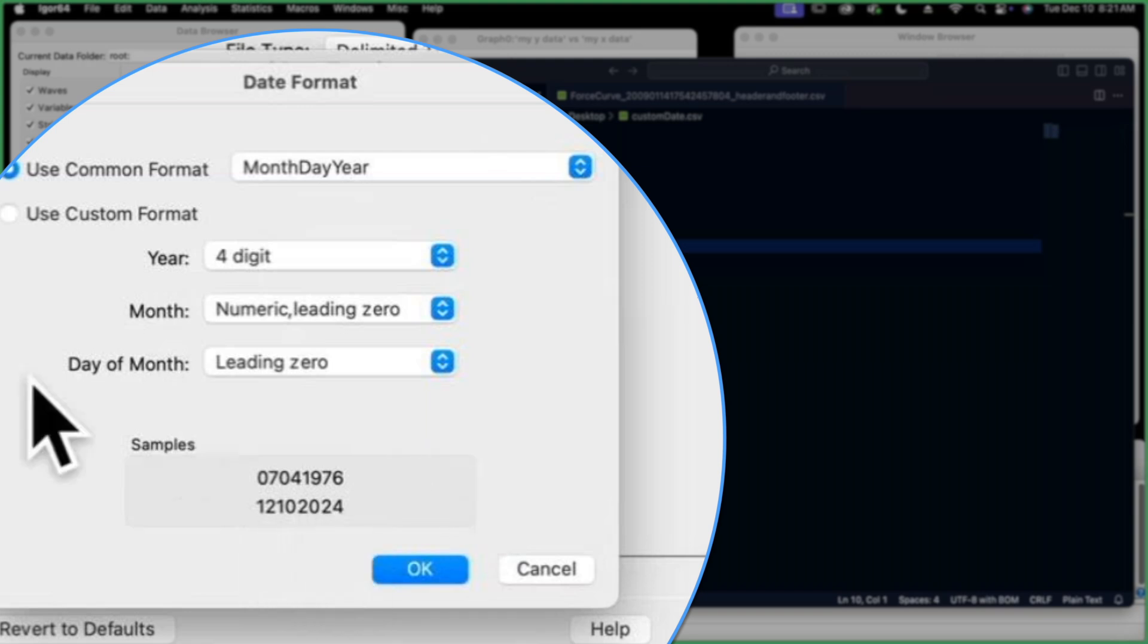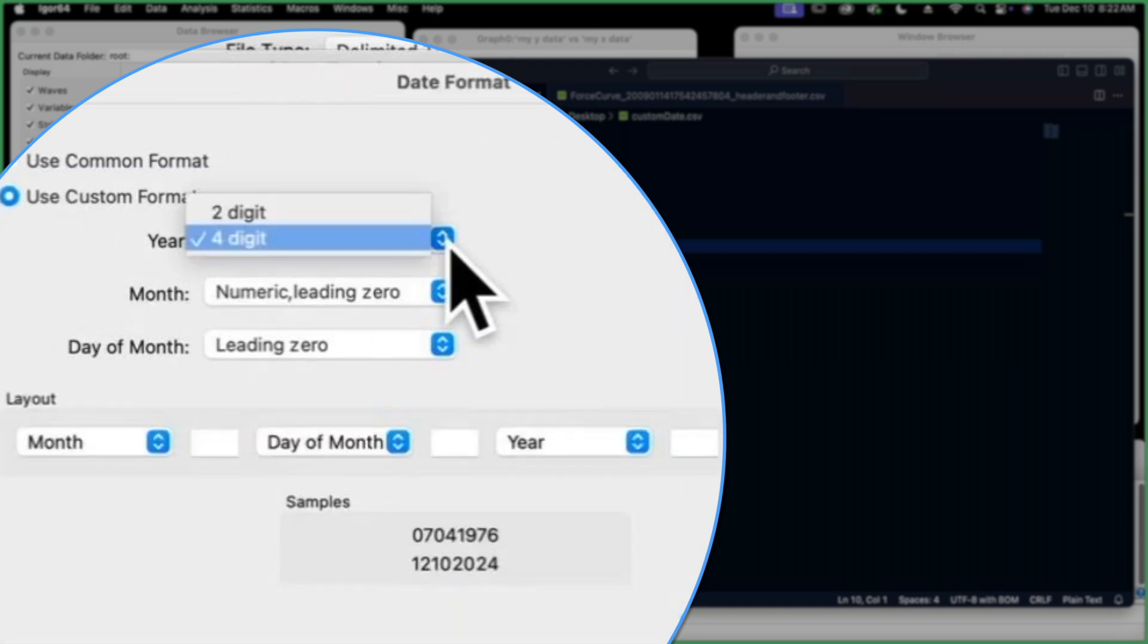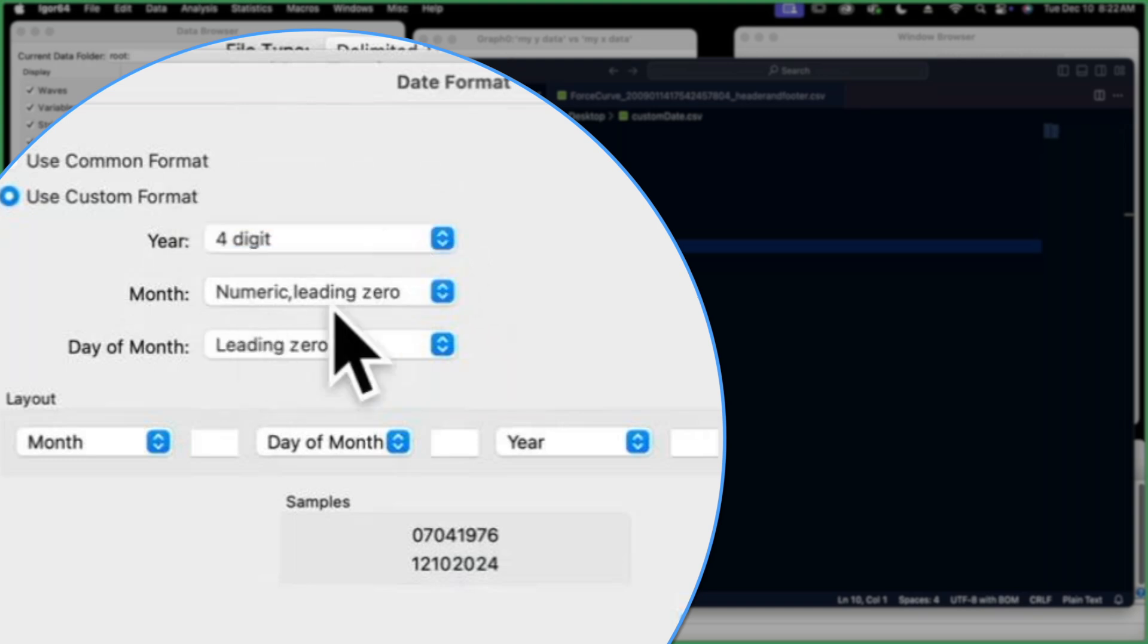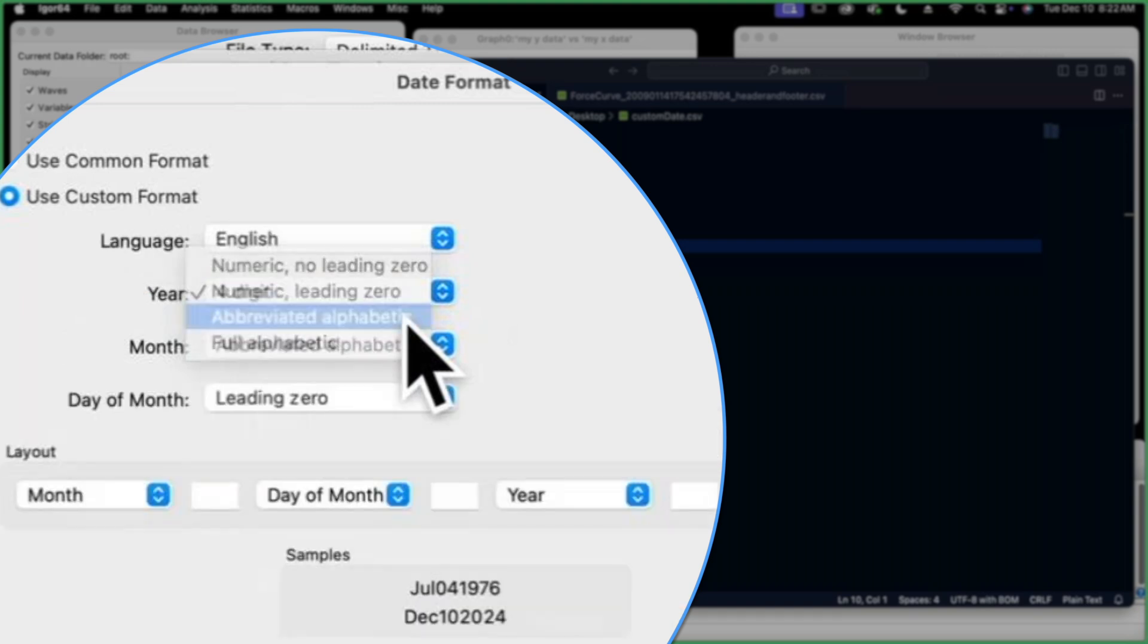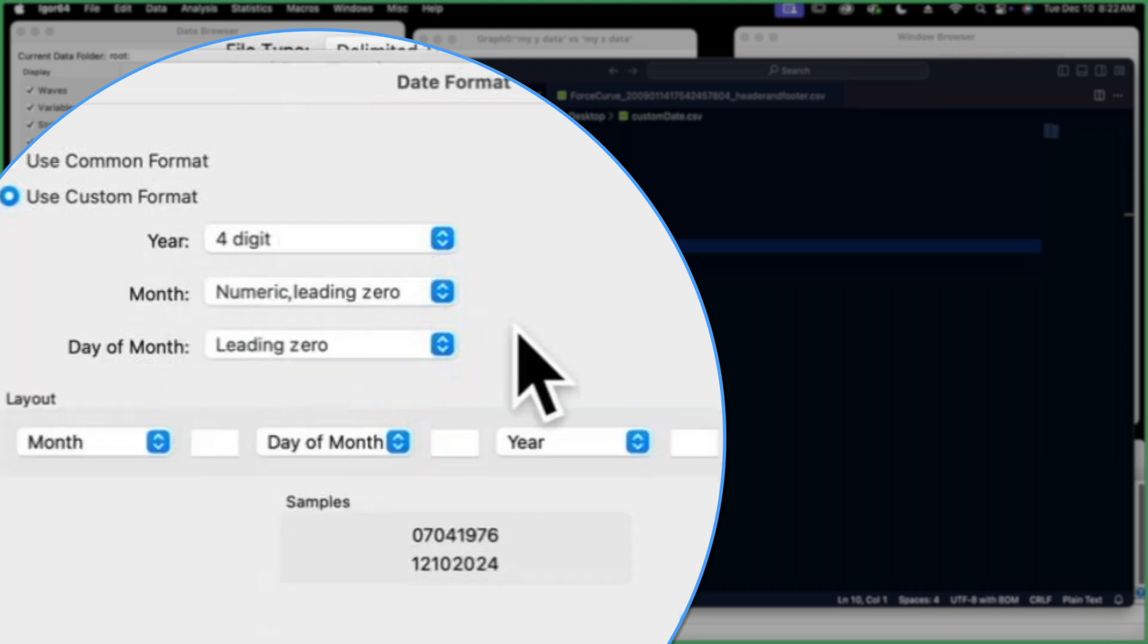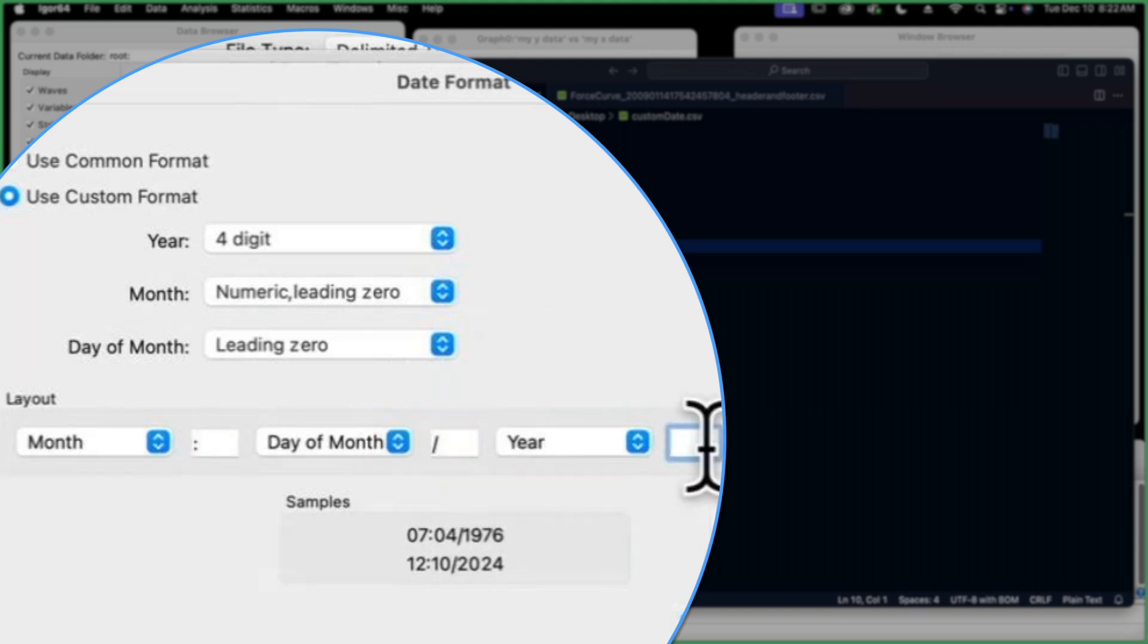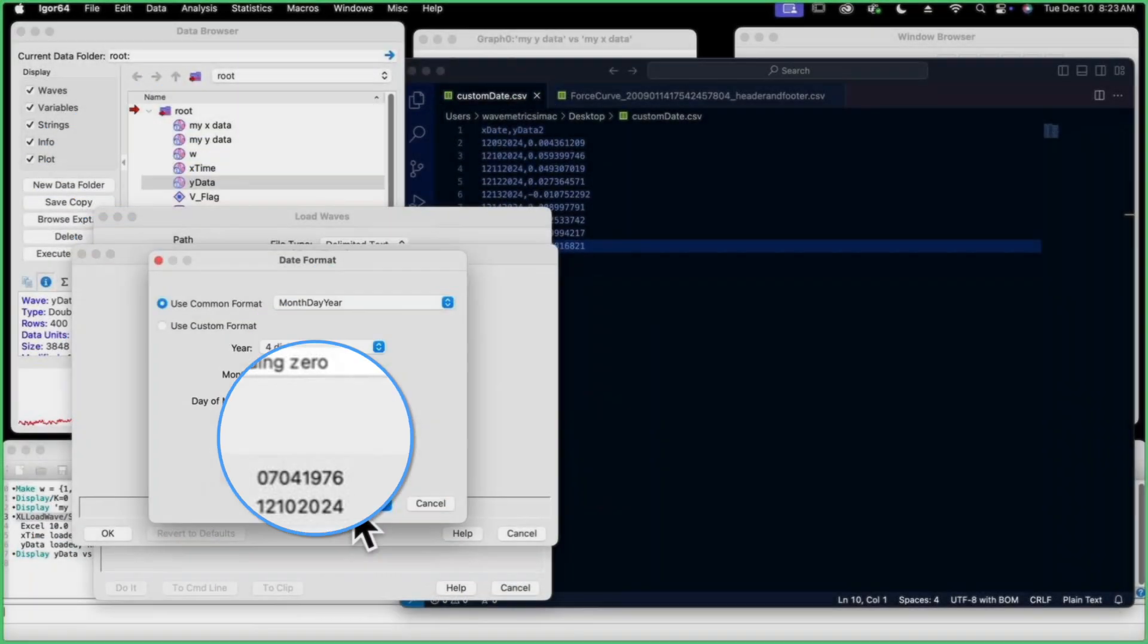If this was different in some way or we wanted to use a custom format, we can do that as well. We can have the year be four digit or two digit. We can have a numeric month with a leading zero. We can have abbreviated alphabetic month, so that would be DEC, for example. We have lots of options. No leading zero is also an option, and we can put them in different orders and put in our own interesting date formats, whatever it may be. We have those options. But we're going to use month, day, year for this.